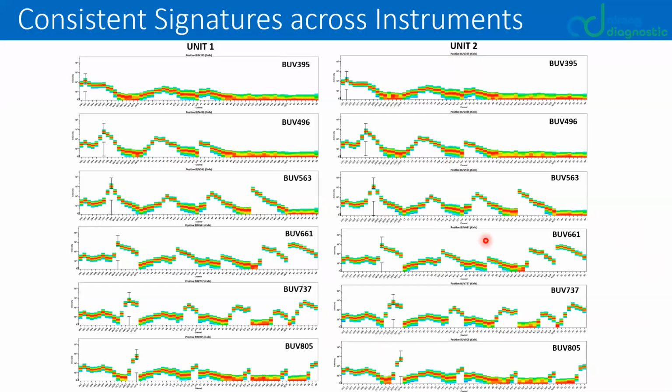Here you have an example for two different units which give identical output data for the fluorochromes listed here. Look at the signatures. They are exactly the same. This standardization is achieved thanks to the voltage that is controlled by QC beads rather than by the user.